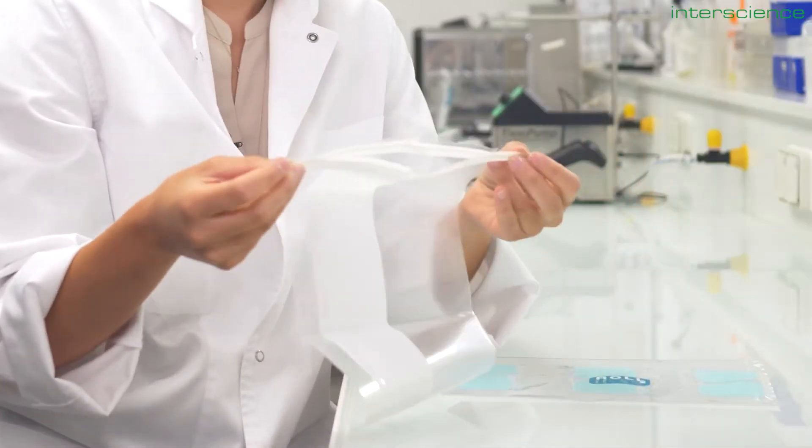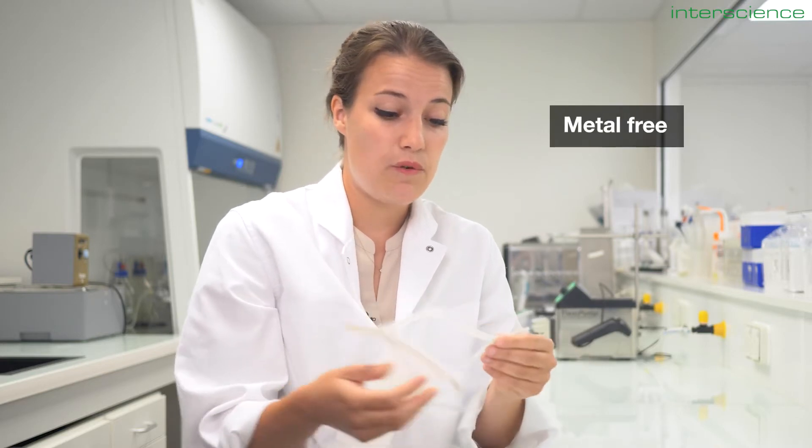Simply put, our classic model needed an upgrade. Feedback from customers pointed to the need for a more user-friendly and secure closing system, eliminating the metal wire that could pose a risk for leakage and cross-contamination.